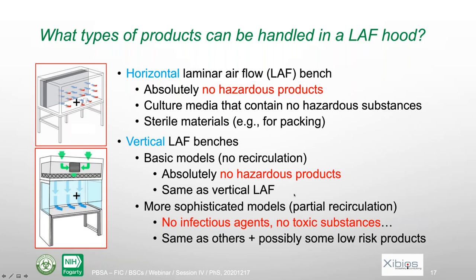Actually, for horizontal laminar airflow benches and the basic models of vertical laminar flow benches, like the one represented here, you can only use culture media that contain no hazardous substance, or sterile materials. For instance, if you need to make an assembly of different sterile parts, or if you need to pack materials that you have just sterilized, in that case, that kind of equipment can be used.